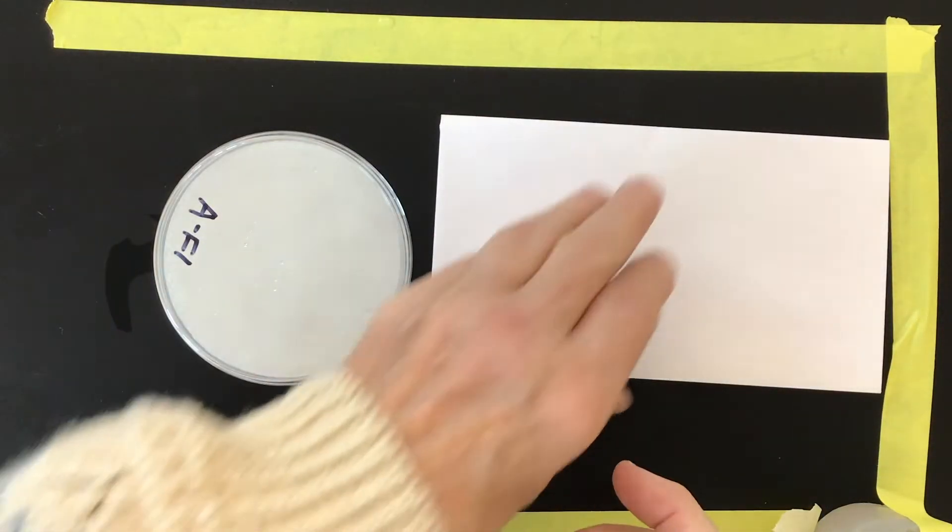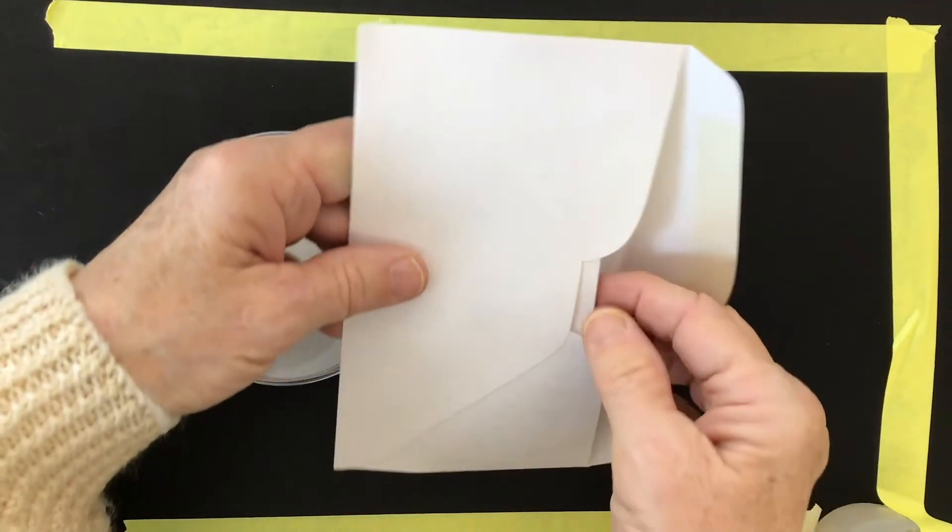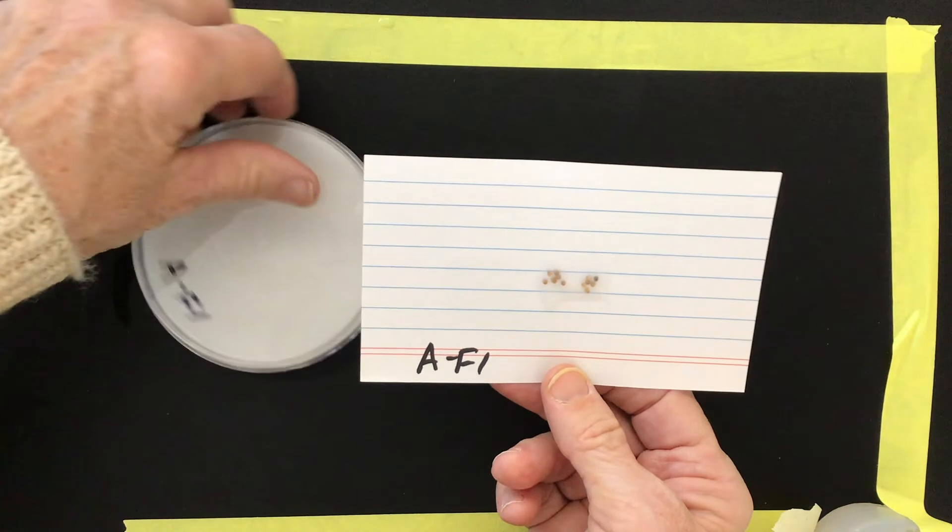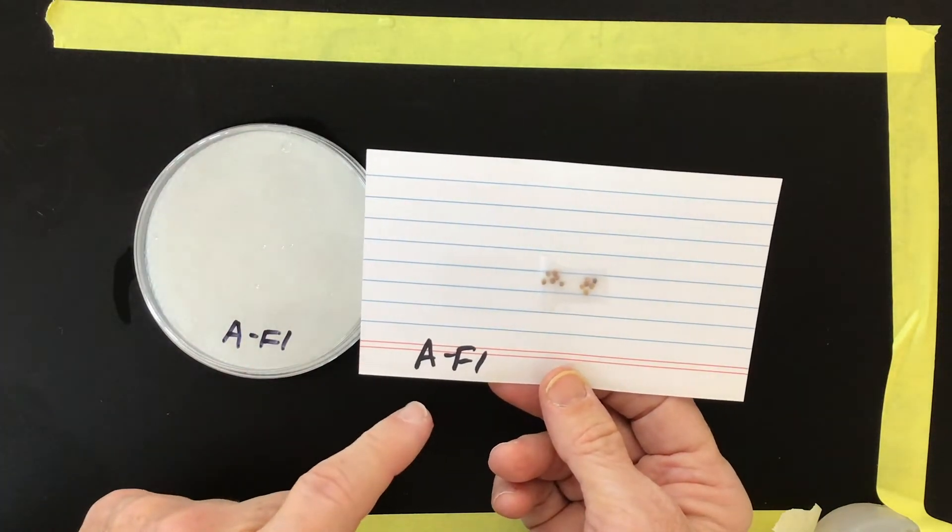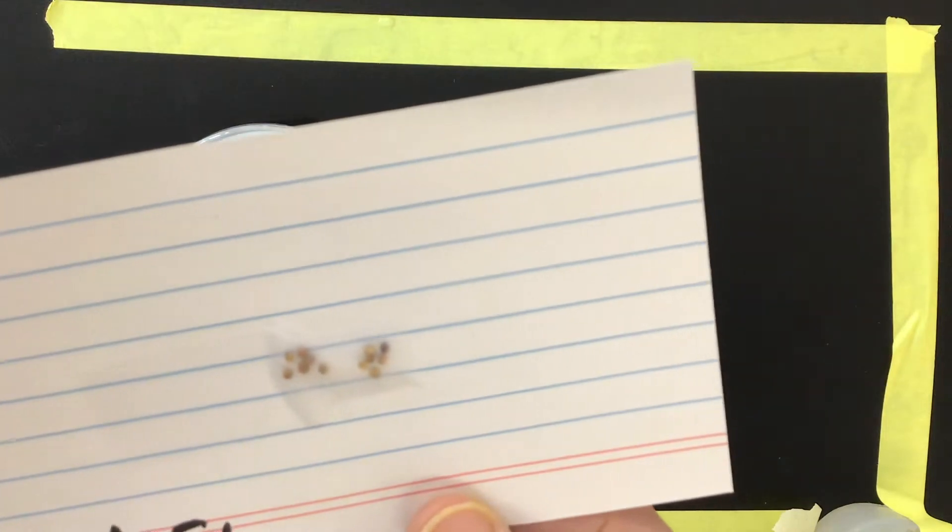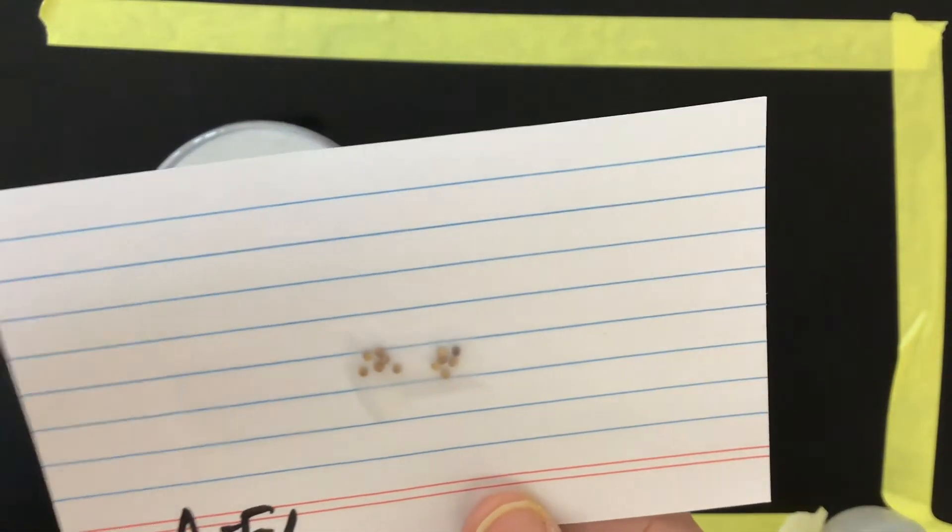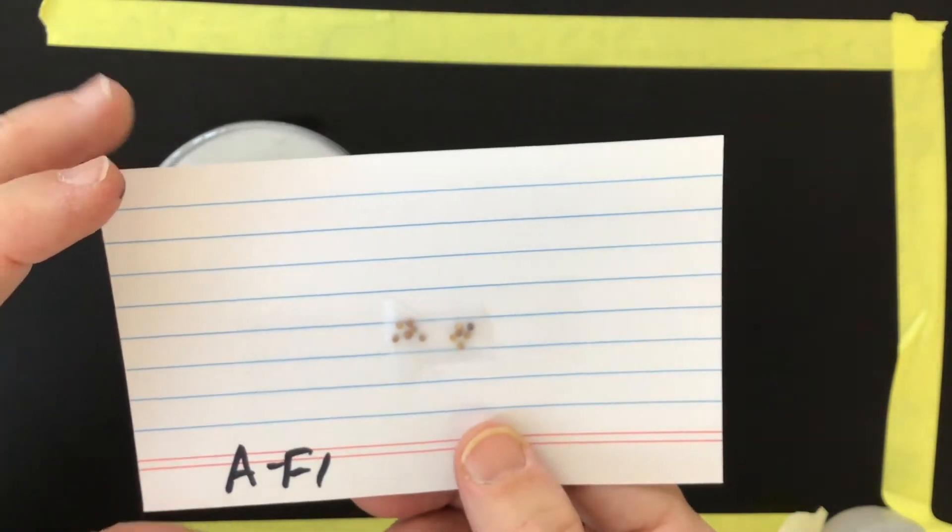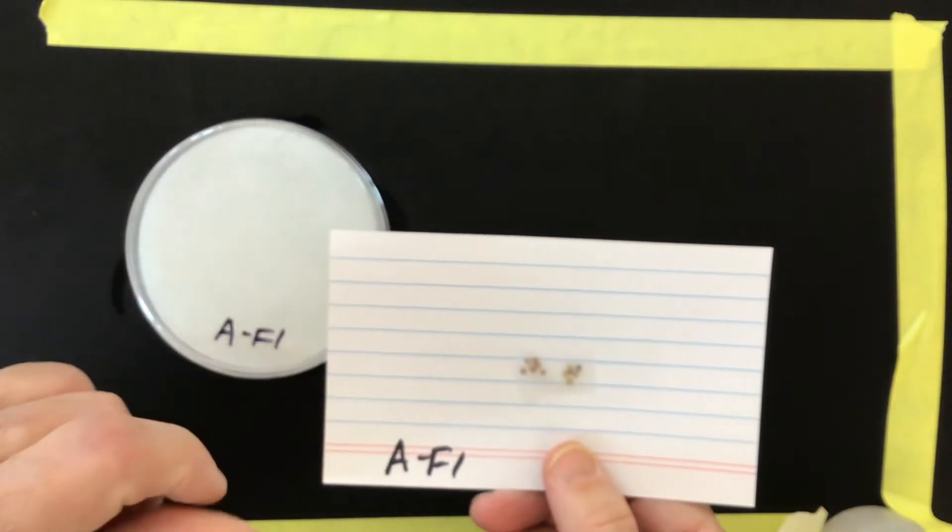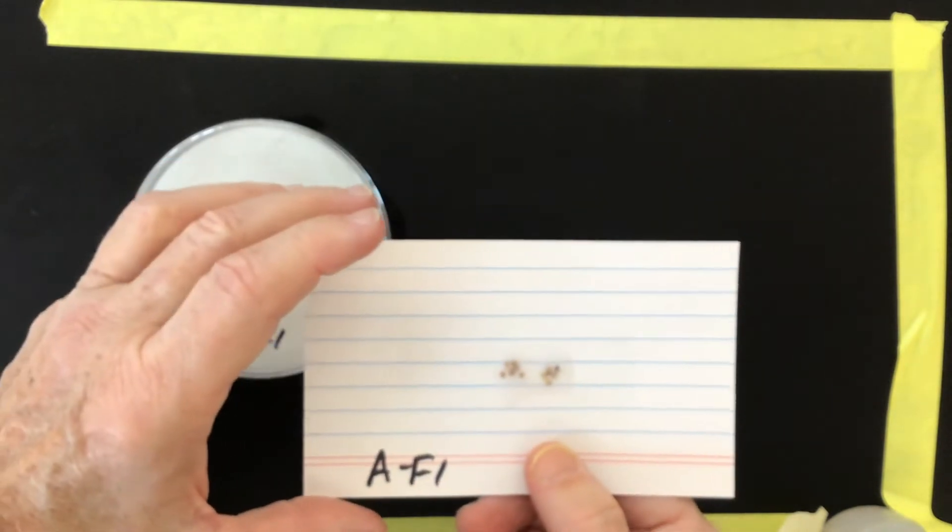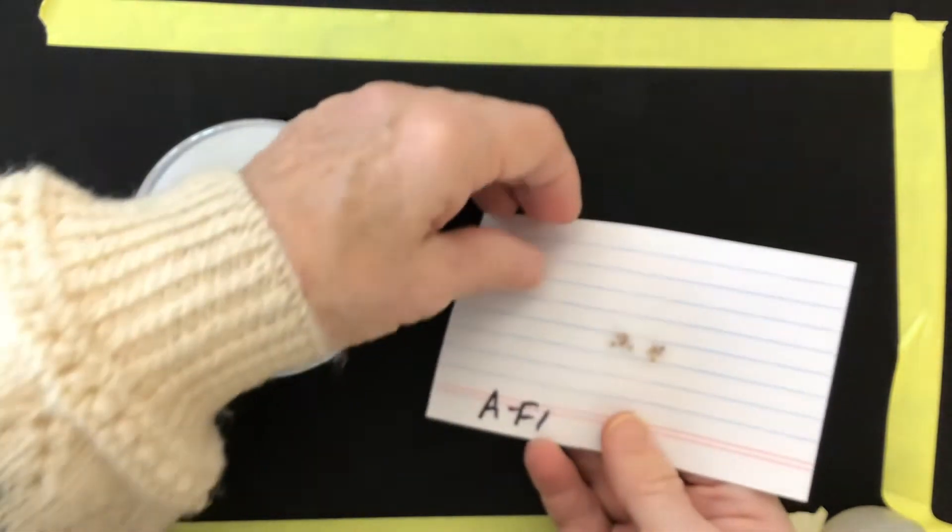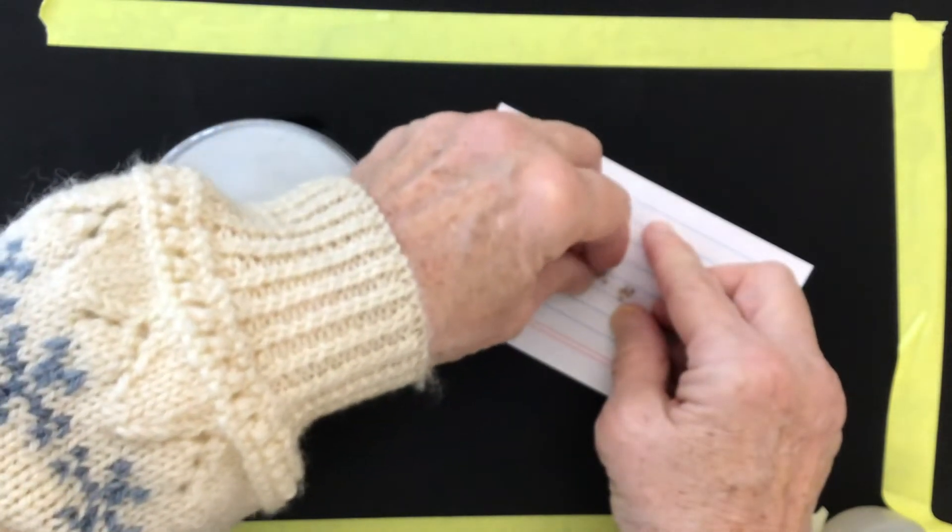Now it's time to plant our seeds. Inside the envelope, if you open it up, you're going to find a card. And on that card, there's a label. So you can double check that what it says on your petri dish, it says on the card. So these are my AF1 seeds. And you can see they're small. I've put them on the card with tape so that they wouldn't get lost. But getting them off here is going to be a little bit tricky. On the AF1s, there are some of them where I don't have any kind of handle. So I'm going to have to use my fingernail to move that tape to get at the seeds.